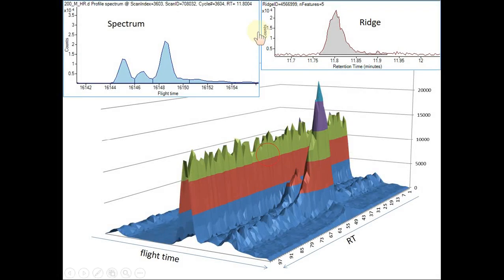From a quantitation point of view, there is a similarity between EIC, extracted ion chromatogram, and SureMass extraction. Both of them are going to look at a retention time range and then look for a mass. In the case of SureMass features, it will return features where the assigned mass is in that mass extraction window. That is different than the EIC approach, which is looking for that ion across time in that window. If the mass were to drift outside that window, you could see a non-Gaussian peak shape.